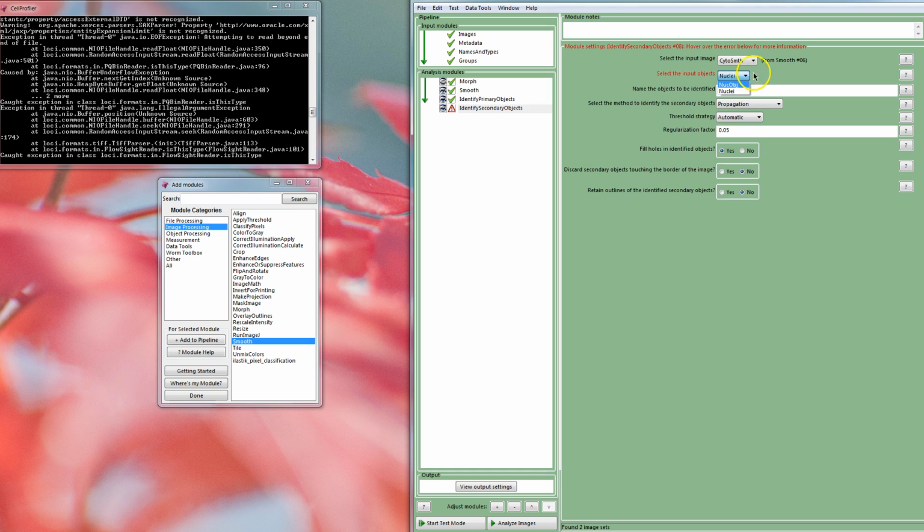And we're going to select the input objects to be the nuclear objects here. These are the starting points for us to try and figure out how to separate between the cells. And this one I find a little bit harder. There's a few more things convoluted together in the process, and I often seem to find what works well and then forget how I did it last time, so I can refer back to other files and things. But once you've got it set up for your particular cells, then you'll find it'll do pretty well across the board, and you can just tweak it a little bit based on your direction.